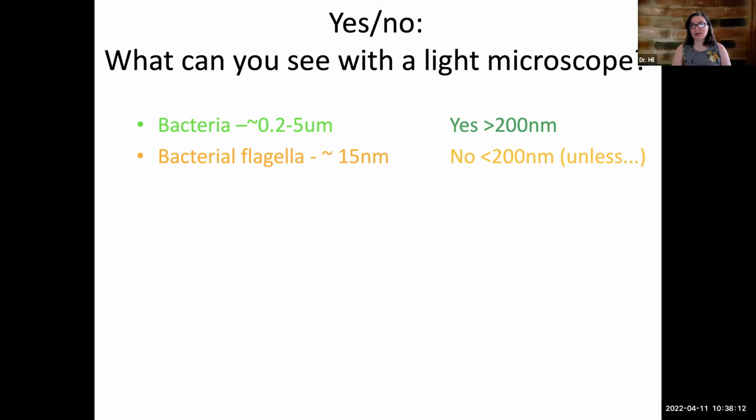It's not going to be a gram stain, though that is an excellent guess. It is a stain. When you hear this name, if you didn't know it already, you're going to just sort of smack your head. It's called a flagella stain. Yeah, we can stain the flagella. It's called a flagella stain because it's a special technique that thickens the flagella so it becomes visible. But typically you can't see it.